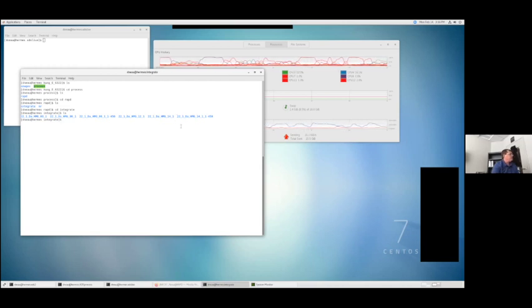Okay. And inside those is going to be this bzip tar file. What that contains, if I expand it out, you can expand that by typing tar -xjf, and this has to be Linux or Unix to do this, and then the name of the tar file.